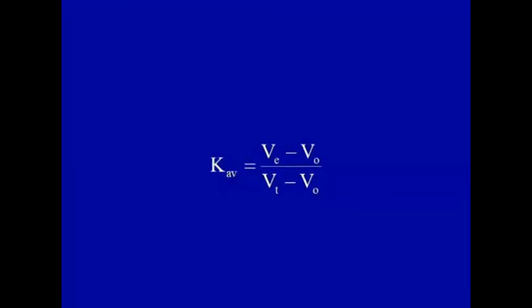A total bed volume can be measured by determining the elution volume of a small molecule that is not in the fractionation range, like salts or acetone. They could be utilized since they have complete access and can easily move in. They just move with the mobile phase and spend the most time in the column, so the elution volume could be calculated by utilizing a very small molecule.